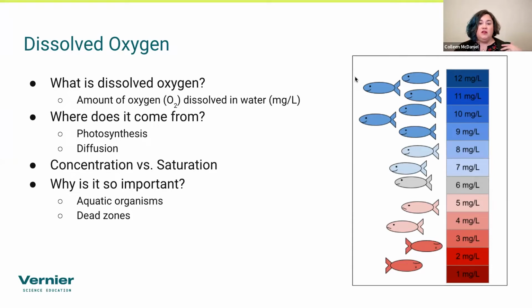Now, a lot of times we are looking primarily at concentration, so how much can the water hold? A lot of people also confuse that with saturation. Saturation and concentration both measure the amount of dissolved oxygen, but different aspects of it.